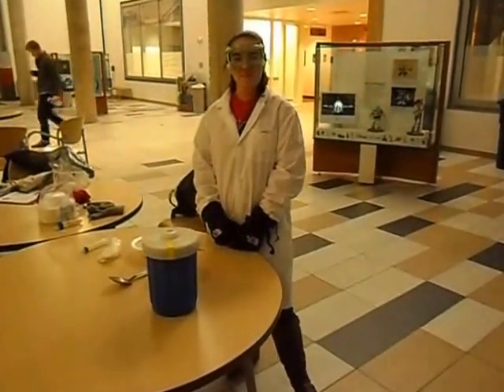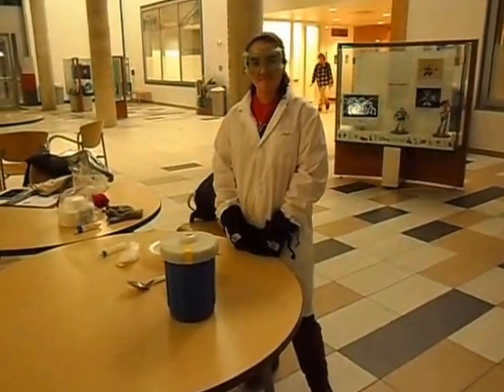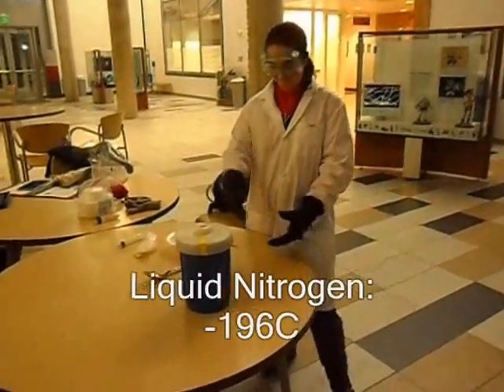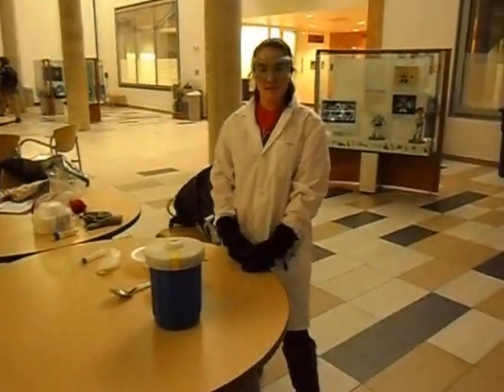There are some safety things to keep in mind when working with liquid nitrogen. First, liquid nitrogen is approximately negative 196 degrees Celsius, which is cold enough to give you a very severe burn.